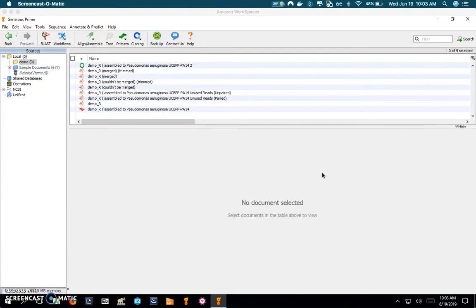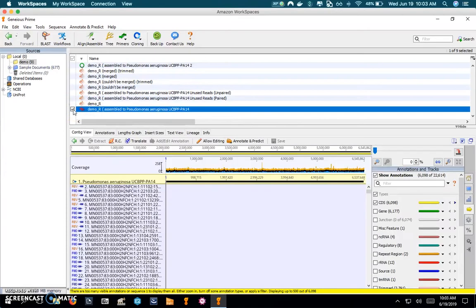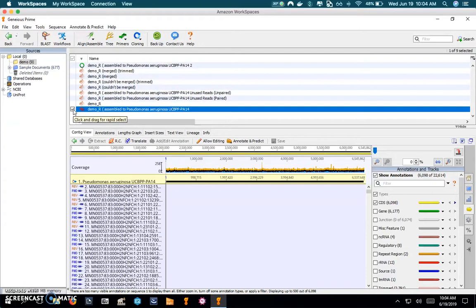What I wanted to do here was just briefly discuss coverage and what that means and how to interpret it. What I want to do here is click on our demo run to bring up the alignment viewer in Geneious.